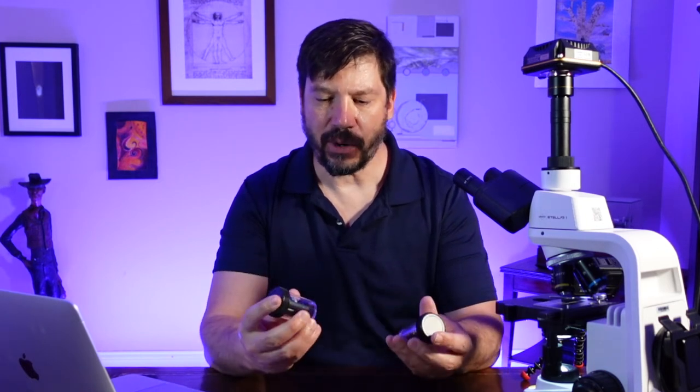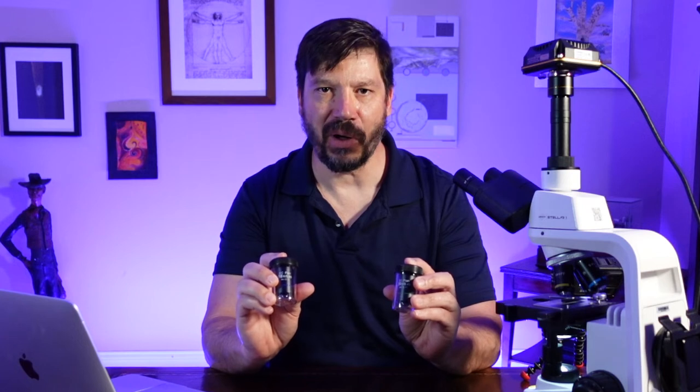And the key thing we're looking at is how small of an adjustment do I have to make on the fine focus knob when I go from the 4x to the 10x and the 10x to the 40x. Those fine adjustments that I just have to make are essential to bring it in very crisp focus. And we want to make sure that with our new lenses that we just have to make similar small adjustments.